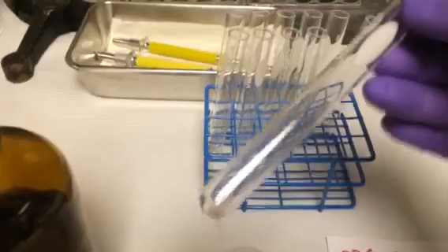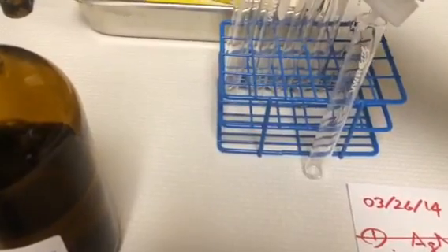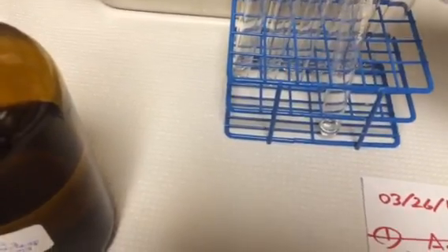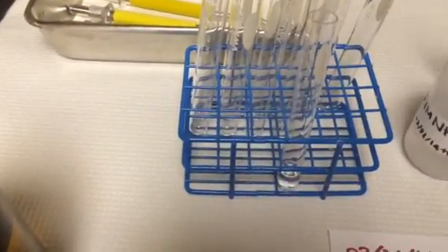Let's try it and see how it's going to work. Clean test tube — I'm going to pour in the 1 molar ammonia, about 1 mL. I got about 1 mL in there.